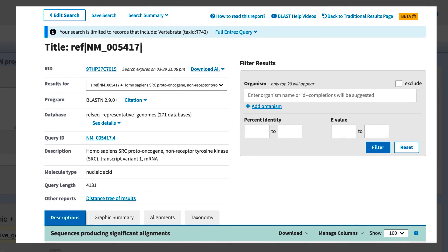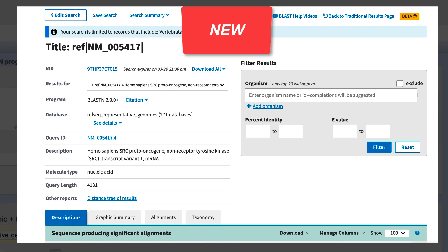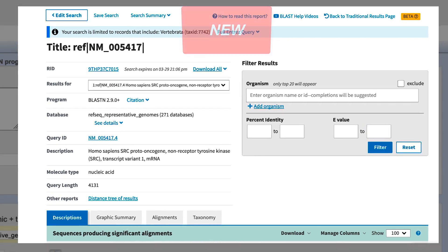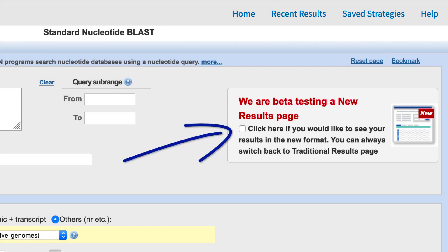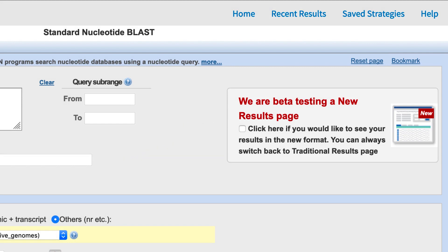In this video, I show you how to access the new results format and highlight some new features. During the testing period, you can check this box on the traditional BLAST submit page, or run the search without that checked and have the option to see results in the traditional format, then link to the new results page. That's what I'll do.